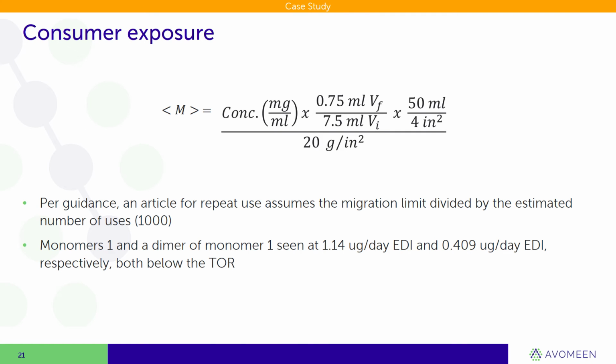And we did that. We determined the concentration in food, M, using the concentration detected, or the limit of detection when we didn't see it. We had 7.5 mils that we concentrated. And when you use oil, you can't just boil it off, but you can extract it into something like a liquid extraction with water, and then bring the water down. So you can do some tricks.